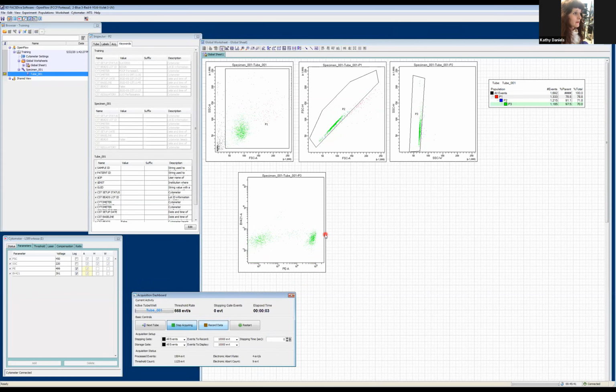So this is a more detailed discussion to be had, but for today, what I'm going to do is just make sure that that positive population of those CD4 cells is on scale. So what we're seeing here is that it's at about 10 to the 5th, which is about 100,000 as we're looking at this plot. I want to make sure that it's not off scale.